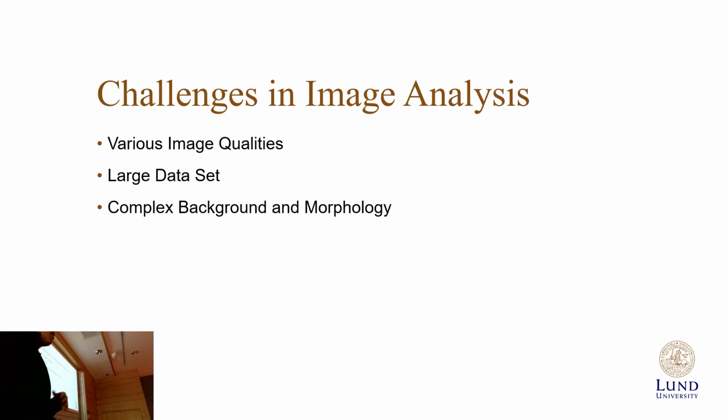And then it comes with the challenge of image analysis, because we put those chips under an inverted microscope, and those natural soil samples don't have fluorescent labels, so we have to identify and count them manually. It's common practice here that we have students count them one by one, with thousands of images. I will show you how the image looks.